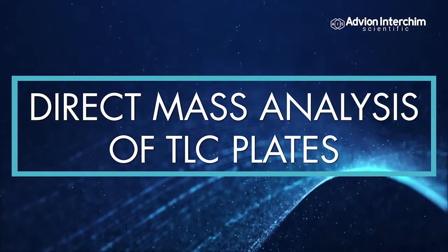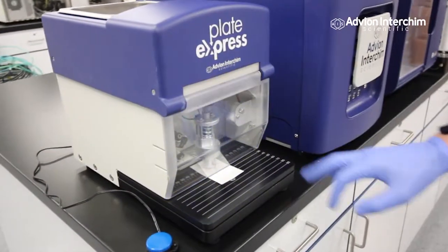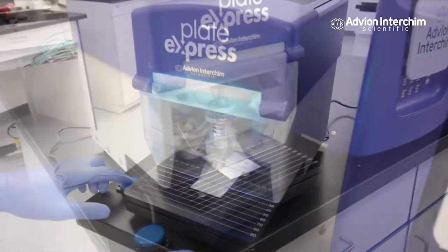Perform direct mass analysis of TLC plates in 30 seconds with the Plate Express. No waiting, no scraping.